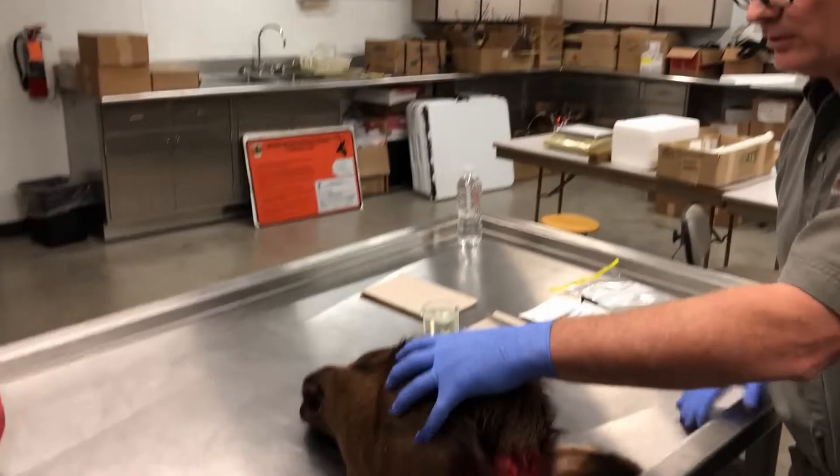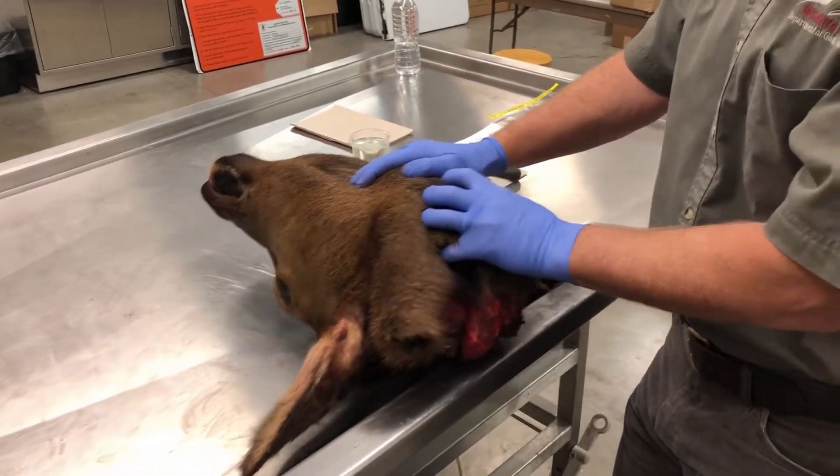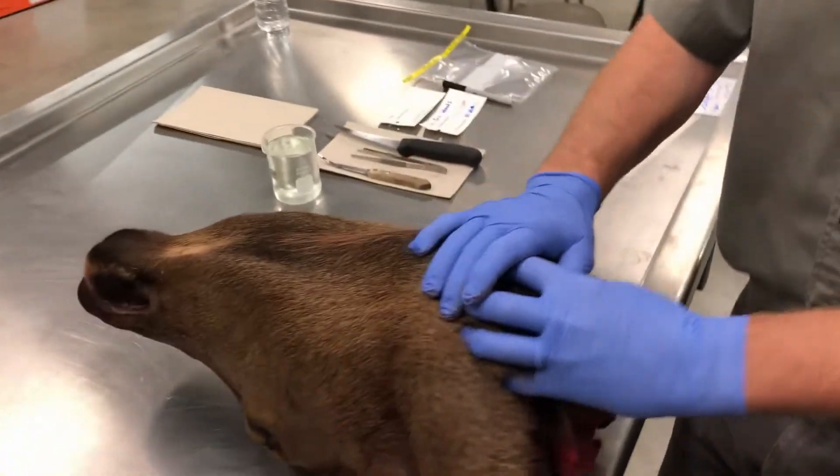So here we have a typical cow elk — it could be a hunter-harvested or a sick animal or whatever. First thing we want to do is show you some of the cuts and the tissues that you're looking for.